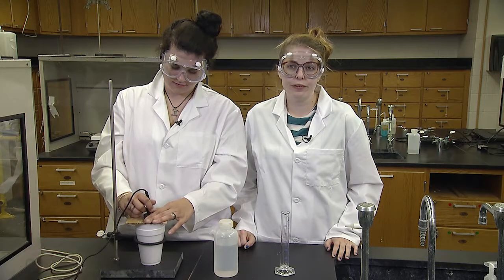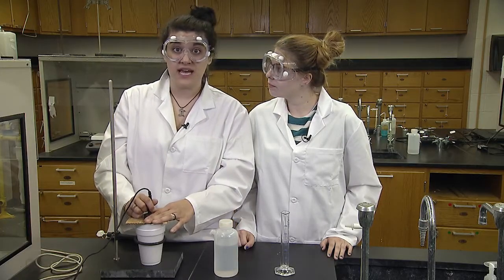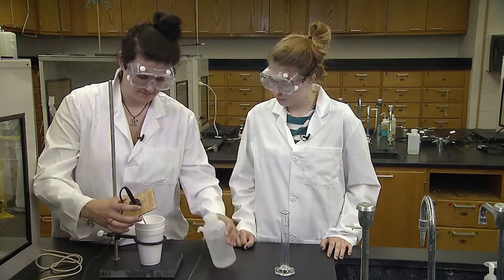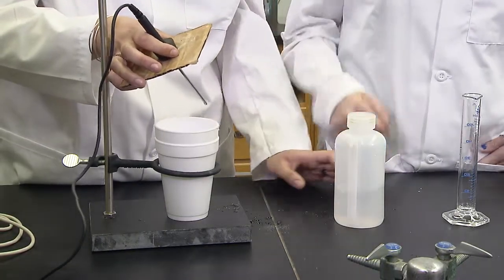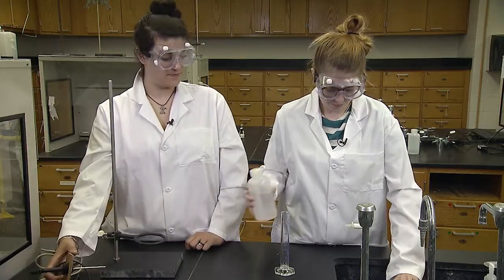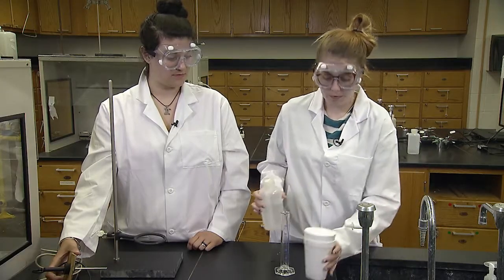Continue stirring the reaction until the computer has finished collecting data for that trial. You can take turns stirring since 15 minutes is a long time, but don't ever stop the data collection before the 15 minutes is up. Rinse the temperature probe between trials. These are dilute household reagents and can go down the drain. Dry the cups with a paper towel and they are ready for trial 2.